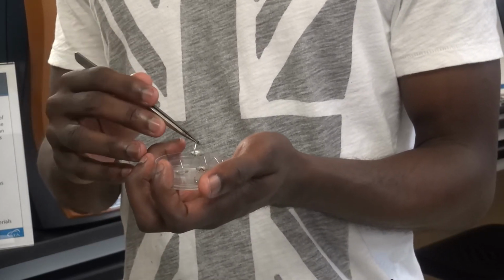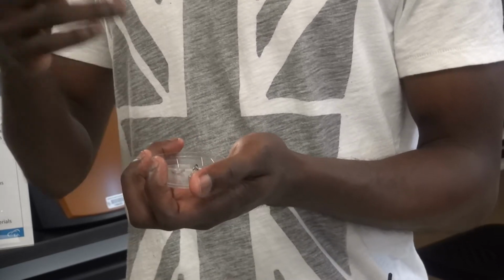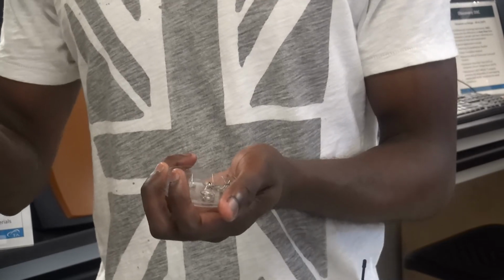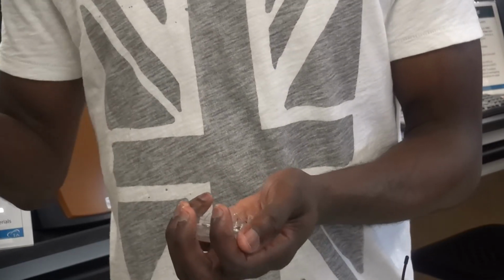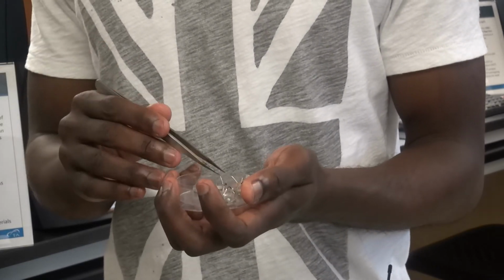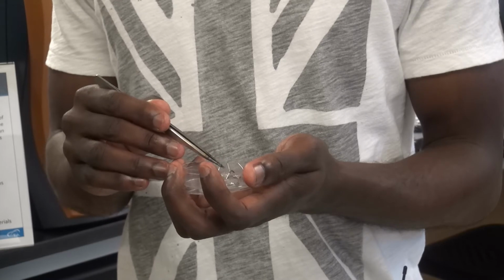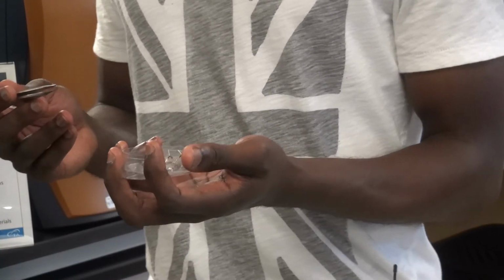You put this black alloy on top of it, it doesn't stick to the hook, so therefore it's rated to higher temperatures than the standard platinum. Of course, platinum as a material can withstand temperatures higher than that, but because of that sticking problem, that's how they came up with these. Okay. That means it's better for us to just use the black one instead of... Not necessarily.